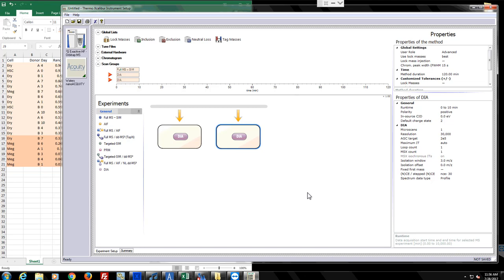It's worth trying. I'm wondering whether it's possible to adjust the collision energy for different m/z windows. Would there be any benefit? There is, and in fact, the instrumentation already does that. At least for the Thermo, it has a built-in optimization, so it's actually affecting the collision energy based on where the window is located. It has multiple curves of m/z versus the actual collision energy that's applied, a separate curve for each charge state.